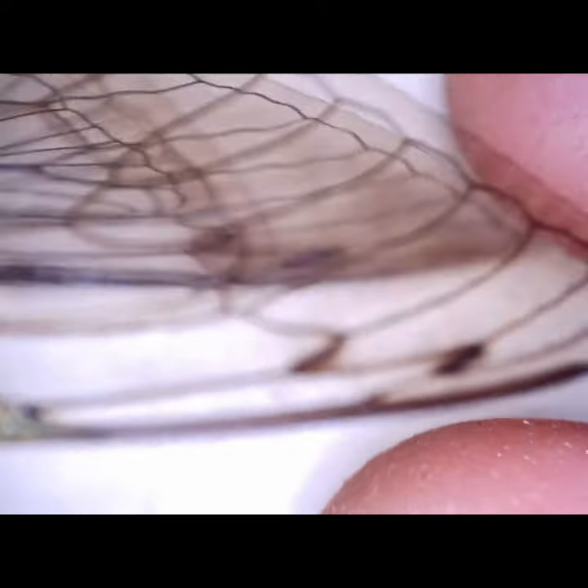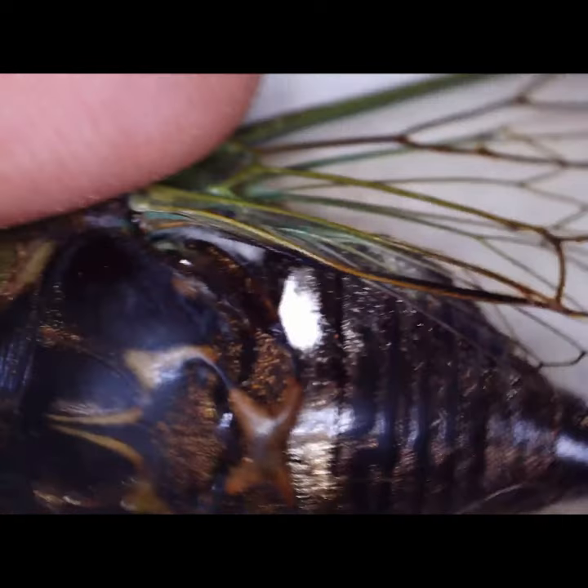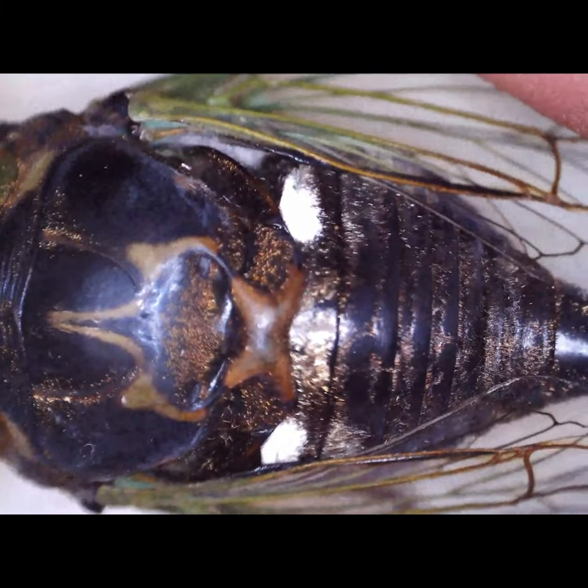We actually found this one last year, and we're gonna take a little bit closer look, a little more time under the microscope. If you want to check that video out, it'll be up on my page later this afternoon or tonight. Be safe.